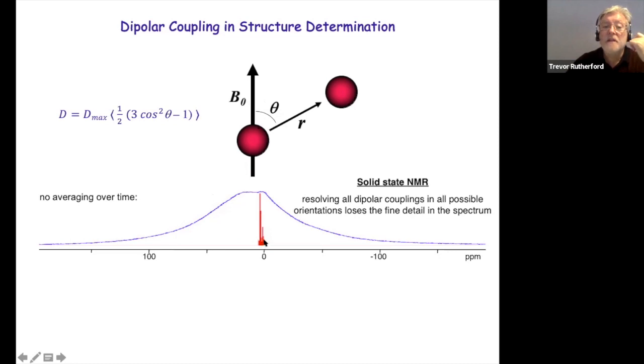If we include a solid state spectrum for that, and this includes the dipolar coupling terms, then dipolar coupling dominates over everything, and we get a loss of detailed information, and the spectrum is of little use because we've lost any fine detail. So when you're looking at solid state samples, the whole basis of the technique is to remove the dipolar coupling by instrumental means that I'm not going to go into because it's not something that we do in-house. We don't look at solid state samples.